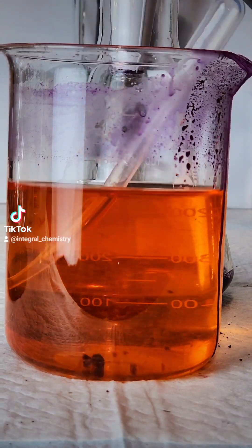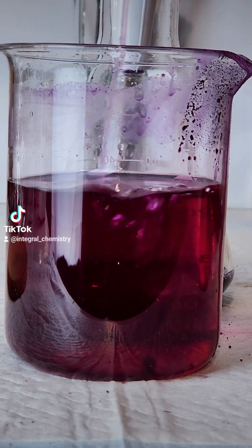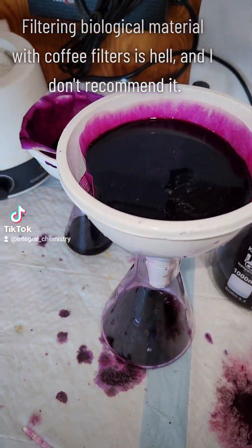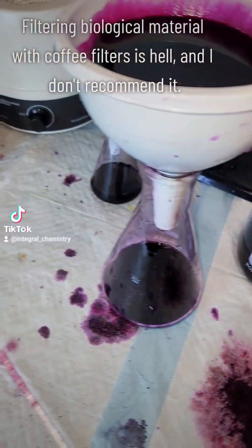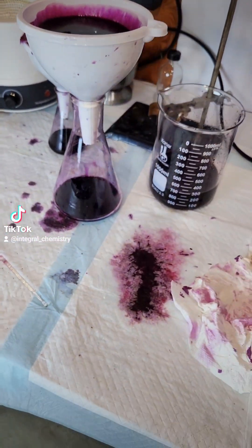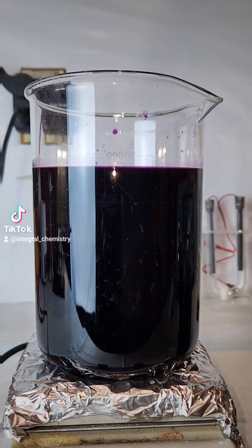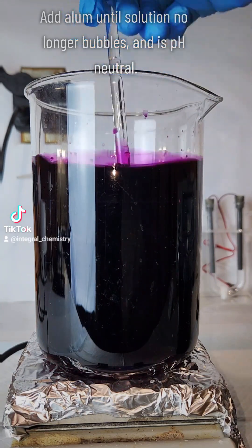What I'm demonstrating here is that carminic acid is a natural pH indicator that will turn yellow in acidic conditions and dark purple in basic ones. I also spent about two days filtering off all my bug body material to leave me with a pure carminic acid solution. This took forever because biological material tends to gum up filters pretty bad, but it was the best idea I had at the time.